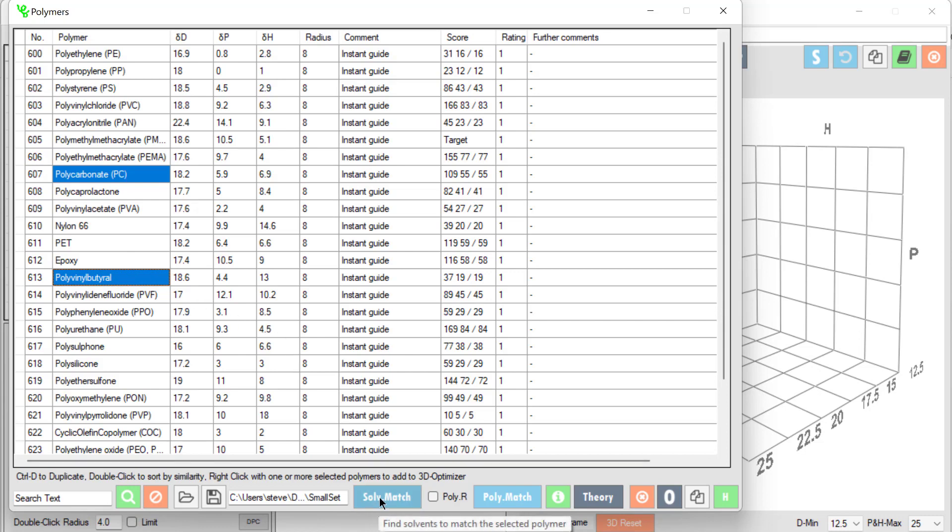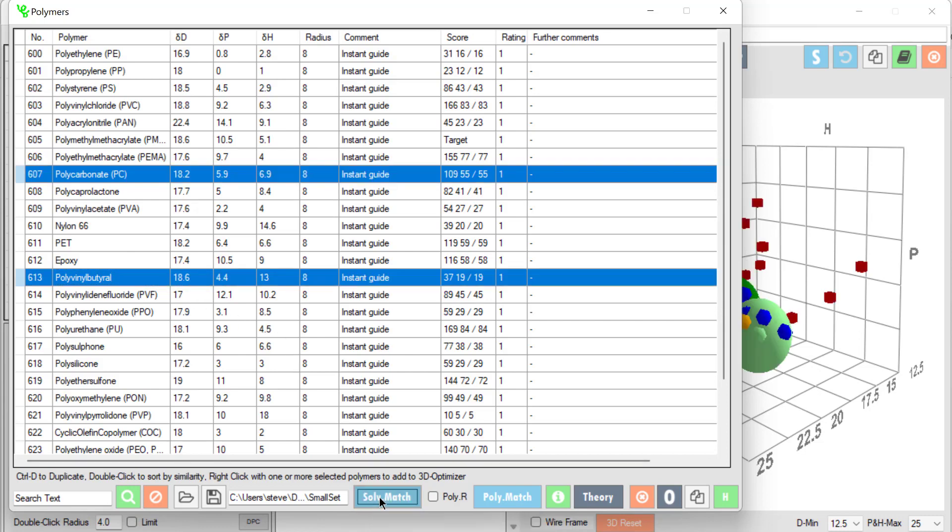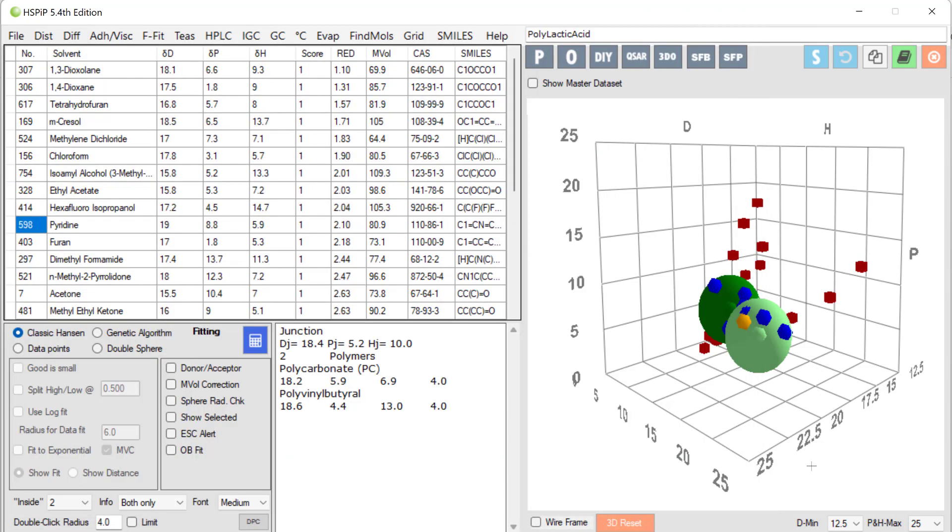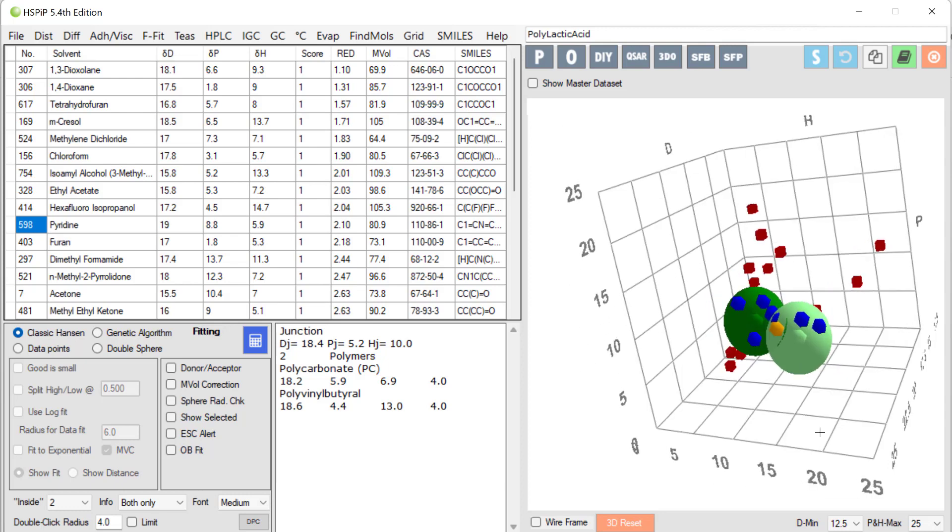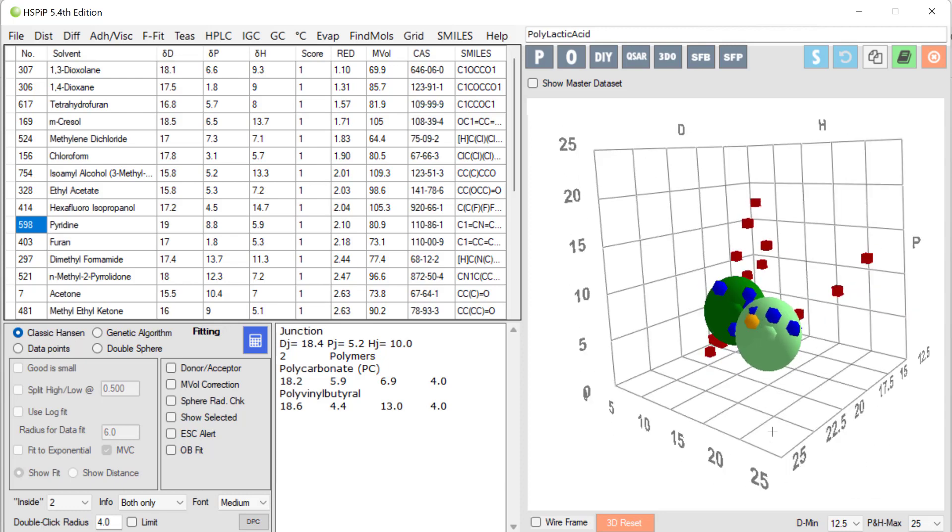I click the solvent match button and you see something happens in the screen behind. So I go there. So now we see our two polymers surrounded by the solvents. In this case they're the solvents that I'd loaded with polylactic acid but they could be your own solvent list. And we can get a good idea of which solvents are good for each individual polymer or for combining them.